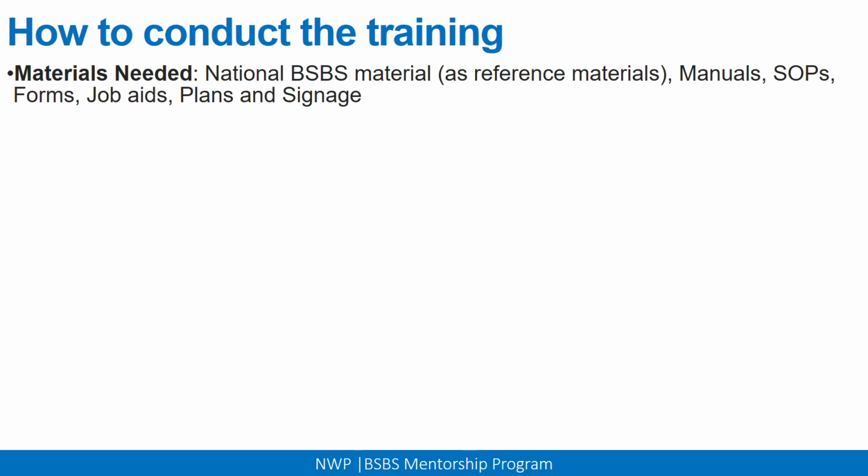If you have any signage that you need to explain, or you need people to be trained on, you're supposed to conduct a training. Then another type of plan that would require you to do a training is your biosafety and biosecurity floor plan.